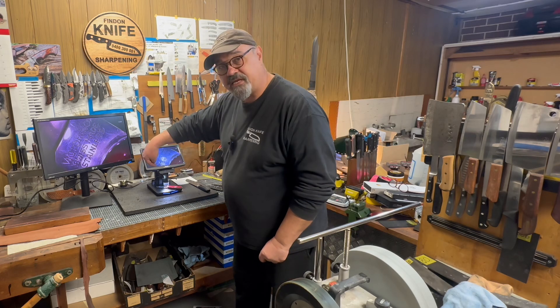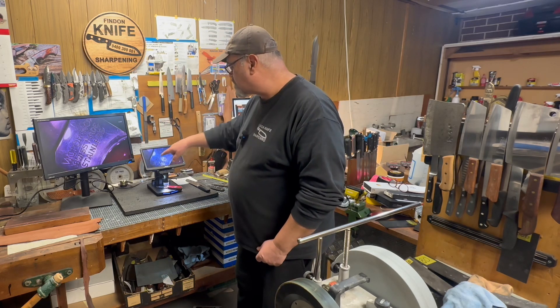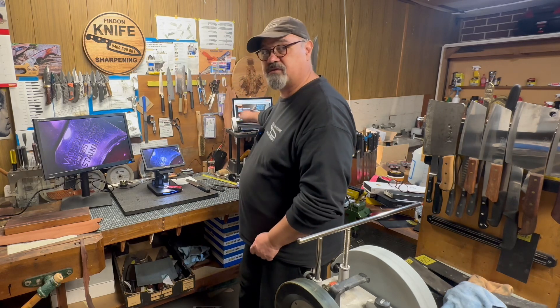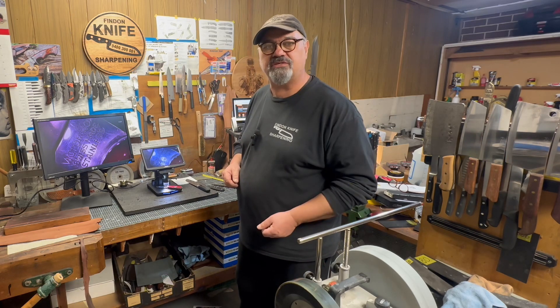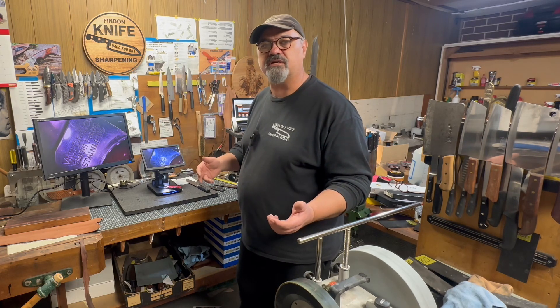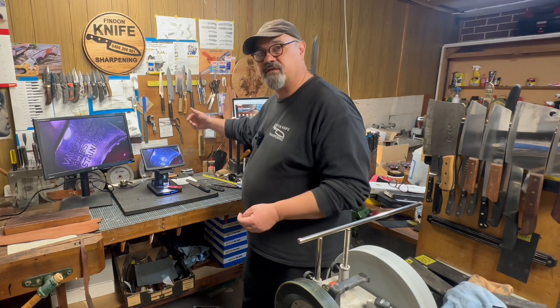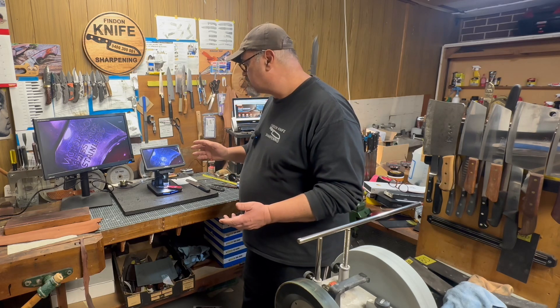It comes with an SD card - 32 gigabytes - and it charges via a USB port. I was a bit confused about how to charge it; they said just plug it into a charger, but there's no charger included. I plugged it into the USB on my computer and a red light at the back started and it charged - no problems.